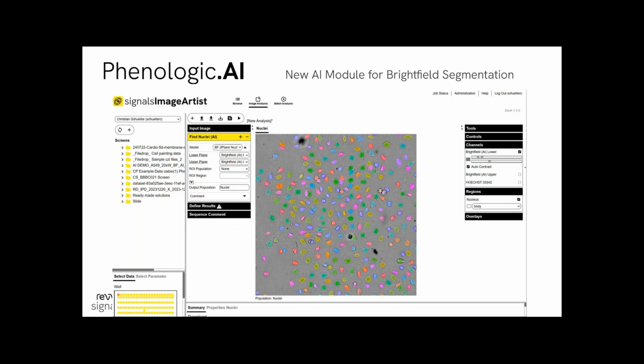Oh yeah, sorry. So that's the image there. What I wanted to quickly mention is this single small orange square here is one visual standpoint in this vast amount of data that we've captured from a primary data capture. So once you let the algorithm work on this particular cell, the single orange cell, it will then, with one press of a button, calculate all of the nucleus and all of the calculations for the entire image set. So that's important to note.